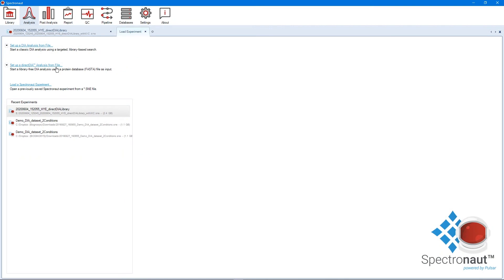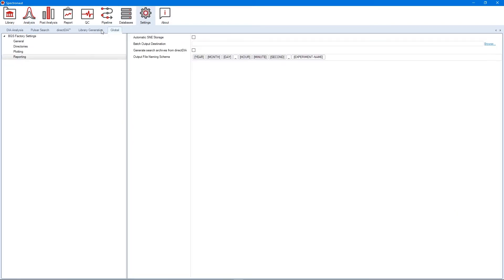In our software, the combined search results without applied FDR thresholds and library filters are saved as so-called search archives. Spectronaut offers two alternatives to save the search archives. The first option, in case you wish to proceed with a DirectDIA pipeline in the analysis perspective, is to go in the report node of the global settings and tick the option "generate search archives from DirectDIA."